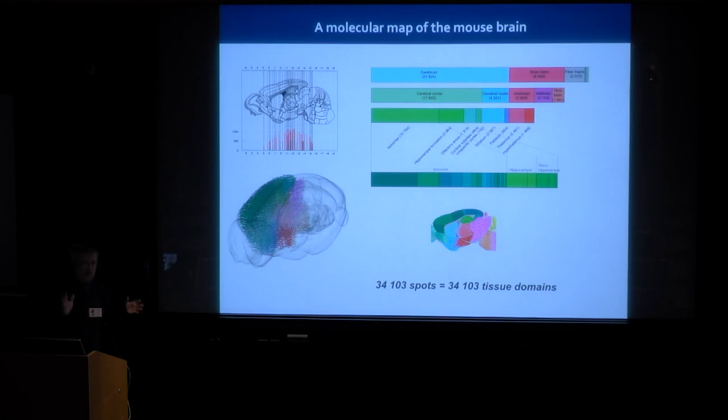So we take advantage of the Allen Brain Initiative by putting our spatial data into a coordinate system of Allen Brain. So the isocortex here has about 10,000 measurements and so forth. And we are able to get gene expression data from all of these regions that Allen has defined. So all in all, we are measuring transcriptome wide for 34,000 different positions within the brain.